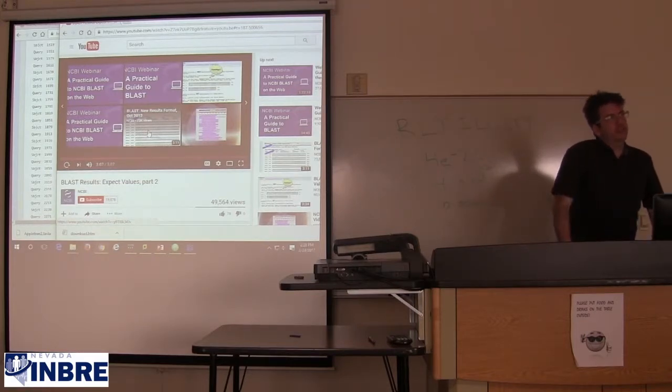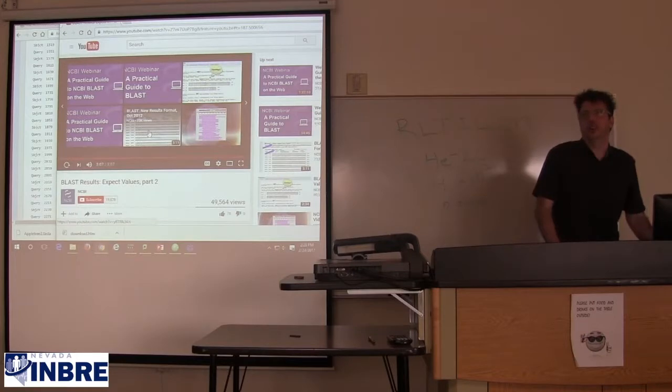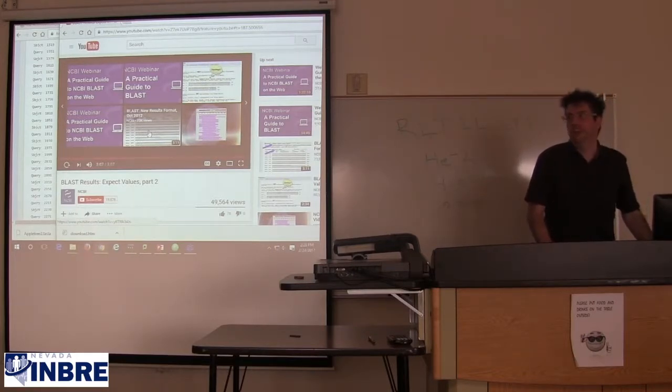Right. I mean, the statistics are just simply numbers that can organize our list in relation to the parameters that were fed to it. We change any one thing, and we change the question that we're asking. So the statistics can't provide us our hypothesis. So our hypothesis has to inform our statistics. And it feels like a bit of a cop-out when you're just trying to find your sea legs about these sorts of things, to be, well, what's my cutoff?